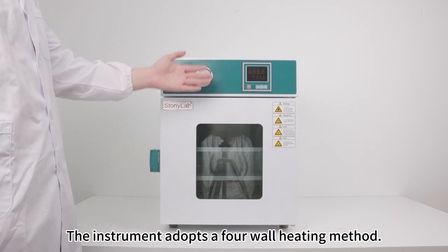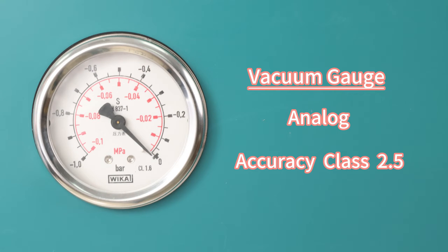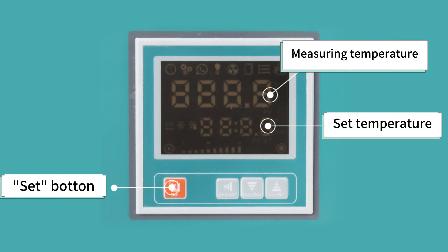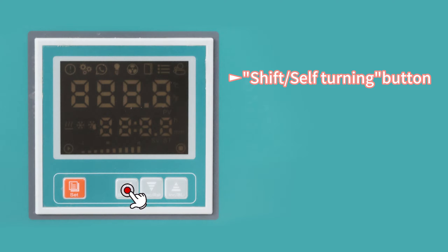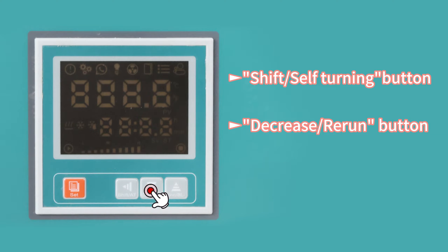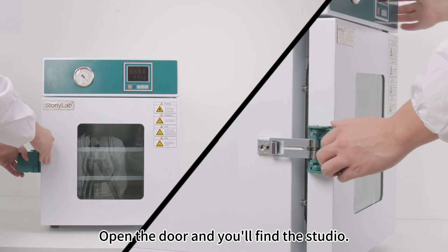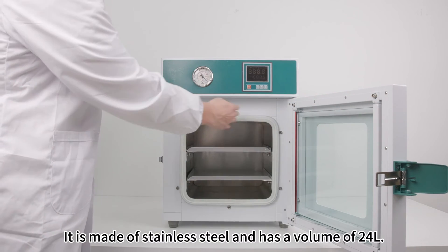The instrument adopts a 4-wall heating method. Open the door and you'll find the studio. It is made of stainless steel and has a volume of 24 liters.